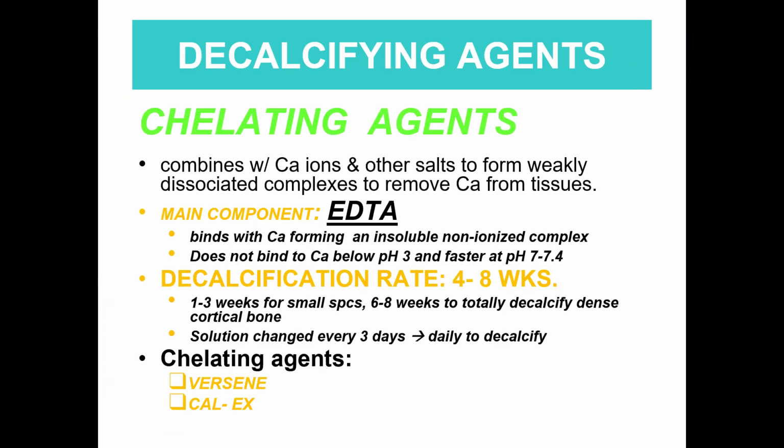Another decalcification agent is your chelating agents. These agents combine with your calcium ions and other salts to form weakly dissociated complexes, enabling them to remove calcium from tissues. The main component of your chelating agents is EDTA.